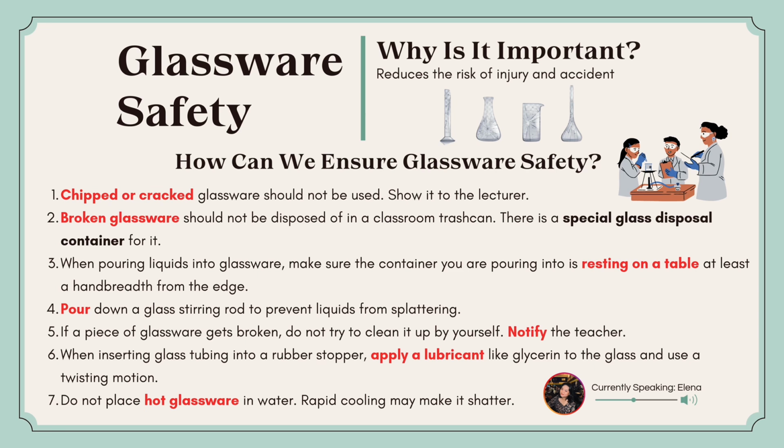When inserting glass tubing into the rubber stopper, apply a lubricant like glycerin to the glass and use a twisting motion. Lastly, do not place hot glassware in water because rapid cooling may make it shatter.